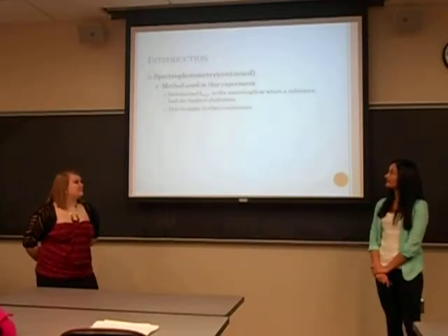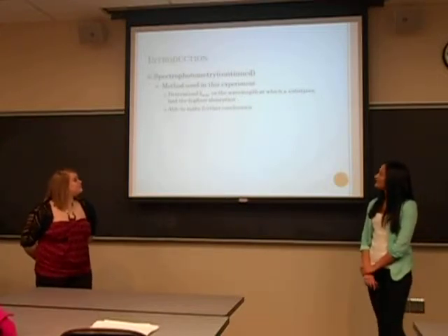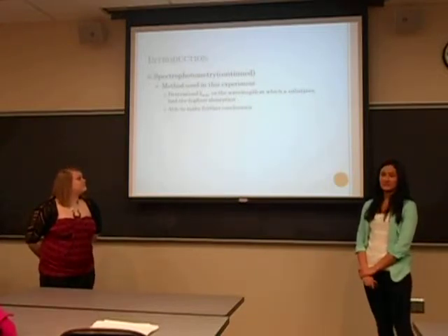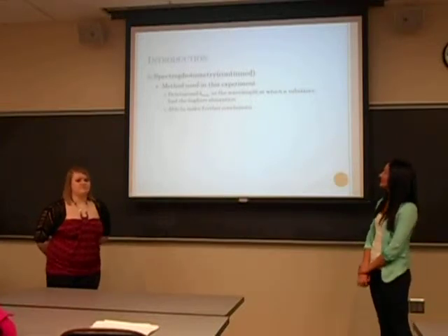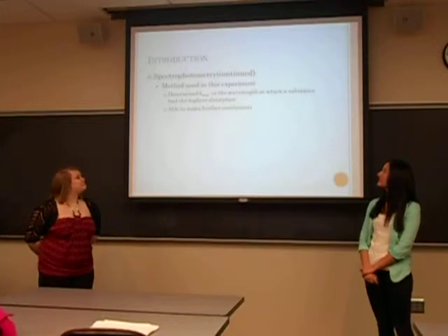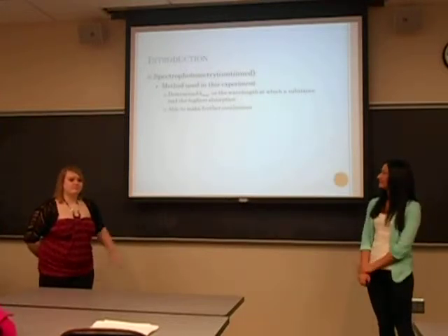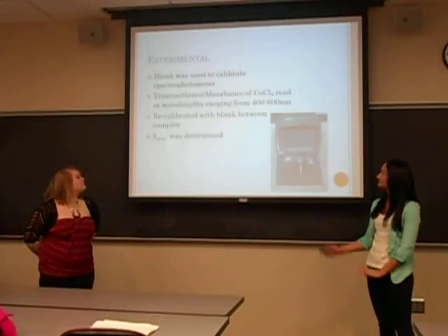Okay, so spectrophotometry was the method used in this experiment, and using spectrophotometry we could determine the lambda max, which is the wavelength at which the absorbance is highest, and from that lambda max we could make further conclusions.